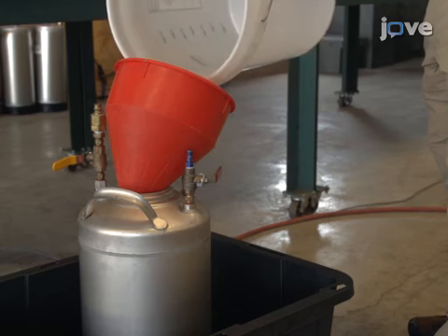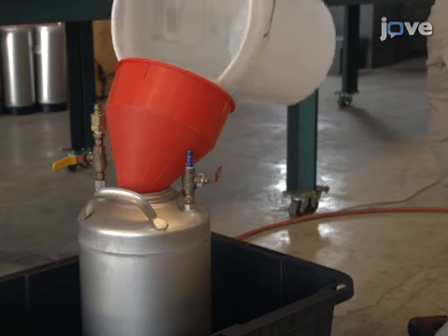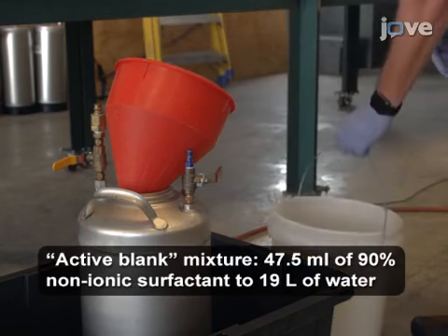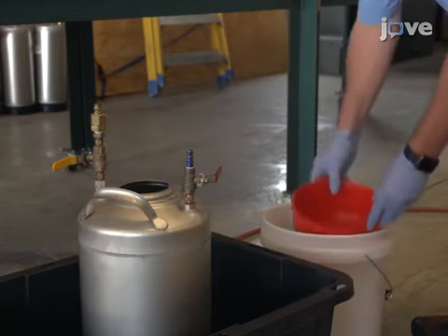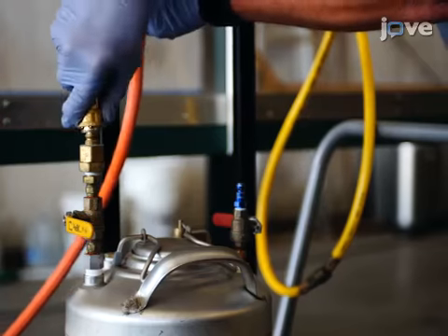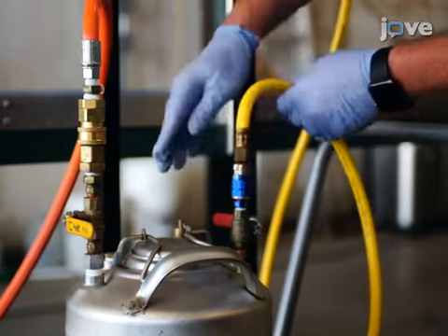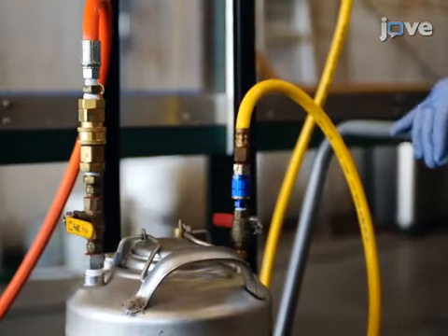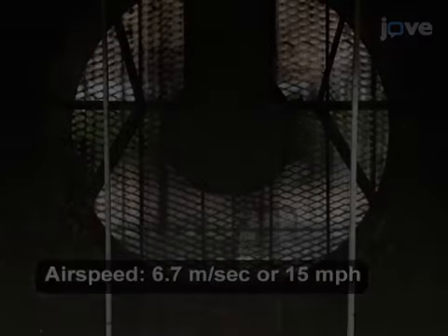Next, move to the stainless steel pressure tank used for the test mixture. Use a prepared active blank mixture to fill the tank with enough fluid for the planned tests. After filling the tank, seal it and ensure it is properly connected to both the air pressure hose and the hose to the nozzle. The next step is to turn on the wind tunnel and set the airspeed to 6.7 meters per second.